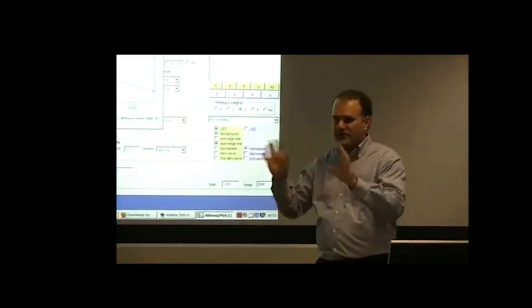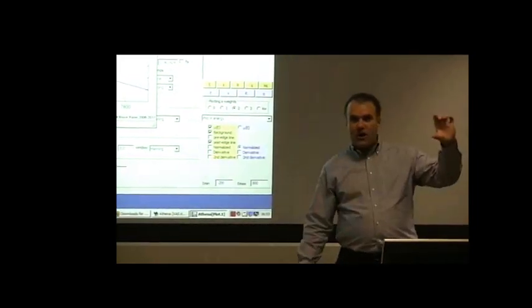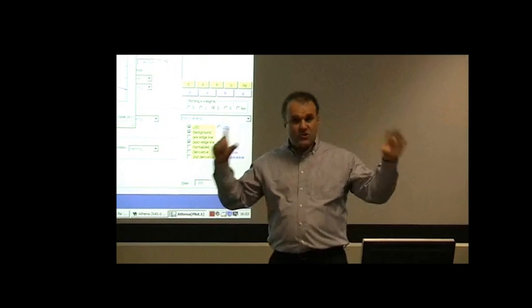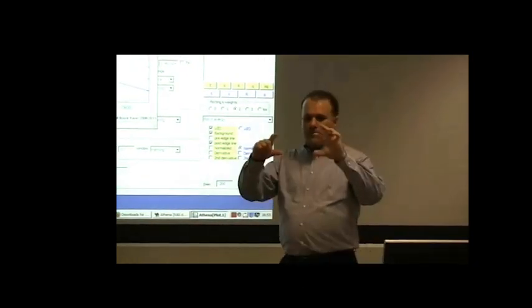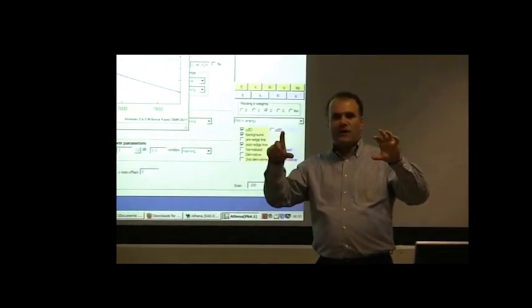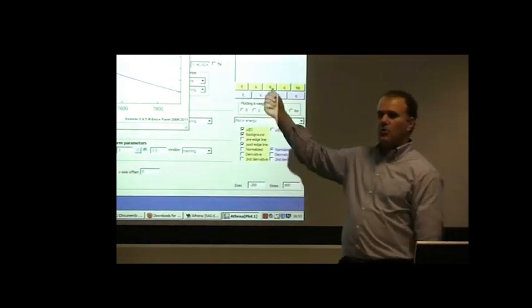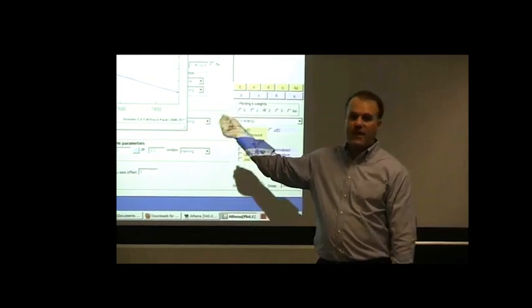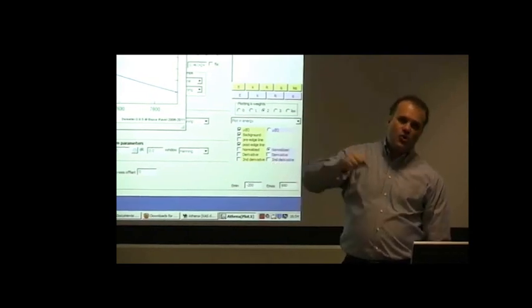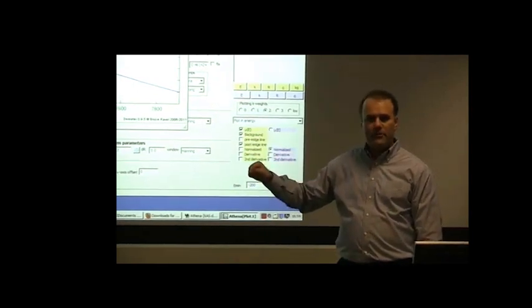Get a jar of the metal, and get a jar of a simple oxide, and measure the two end members. Measure, say, 3 combinations. Make a 50-50 combination, a 25-75, and a 75-25, and then do the linear combination thing that we're going to talk about tomorrow, a quantitative XANES analysis approach. And if you can normalize the data, then do the data analysis and get the answers back that you put into your 3 samples, then you're probably doing the data processing in a consistent manner.